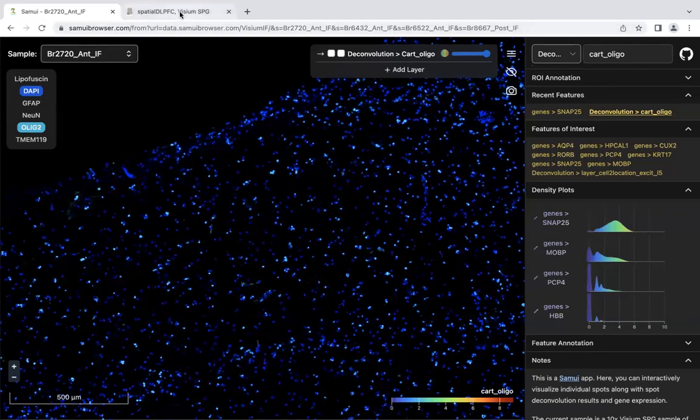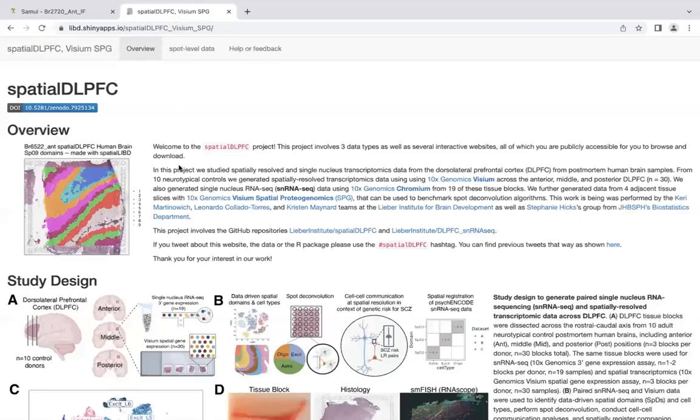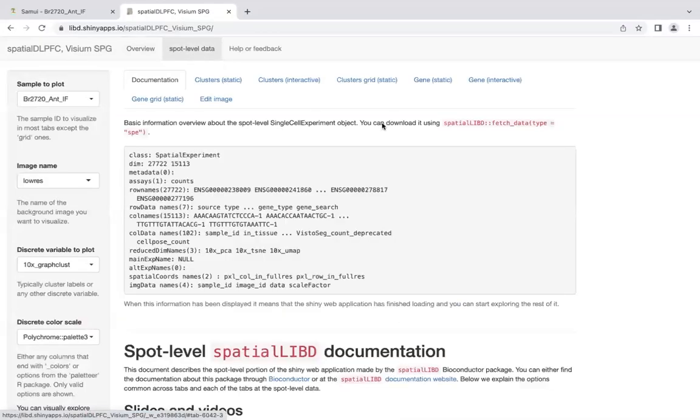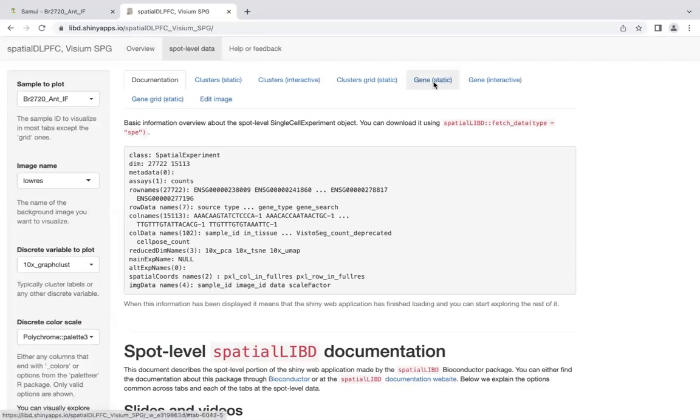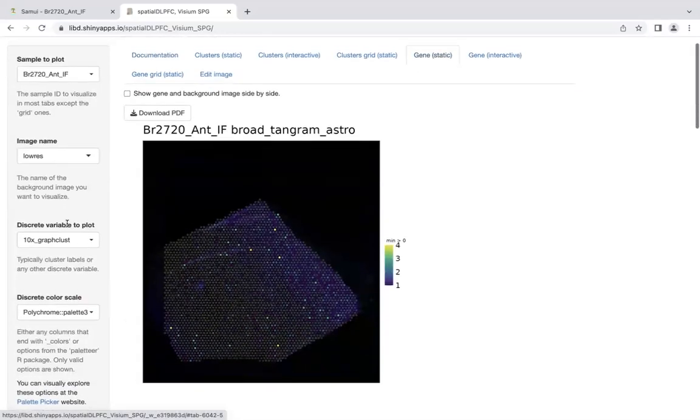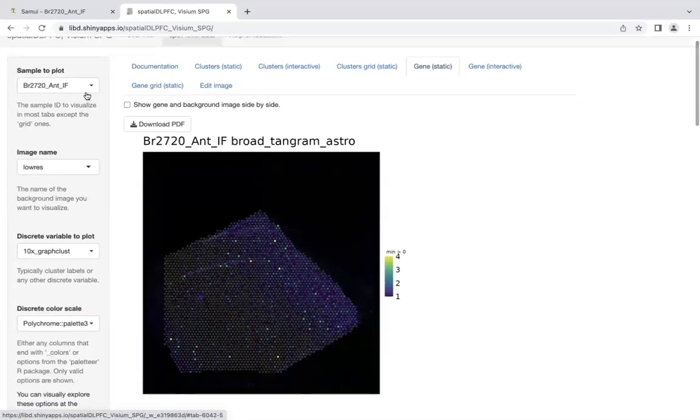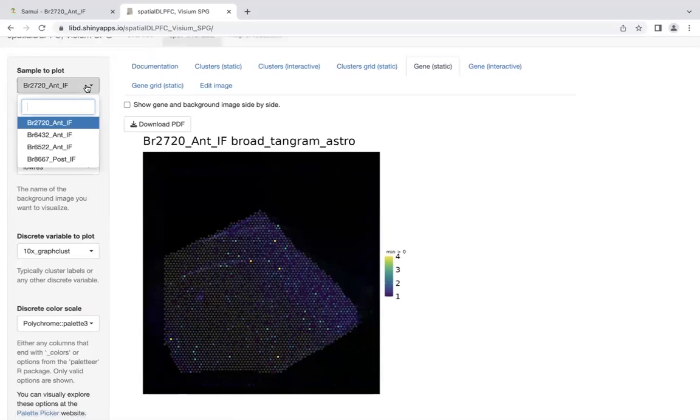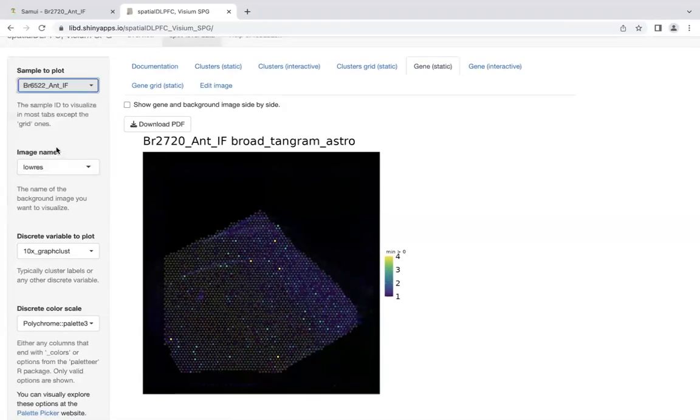The other resource we have are these shiny apps. I'm going to go to the spot-level data, gene static for continuous features. You can view all four samples in the SPG, so let's view this third one.